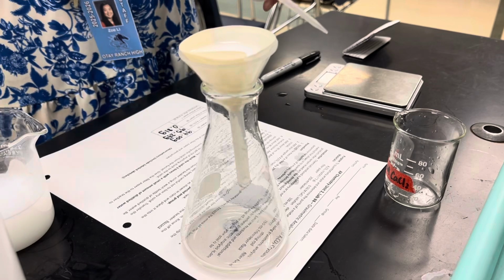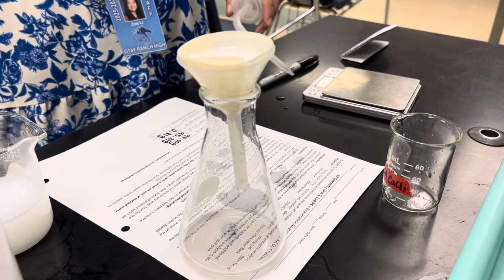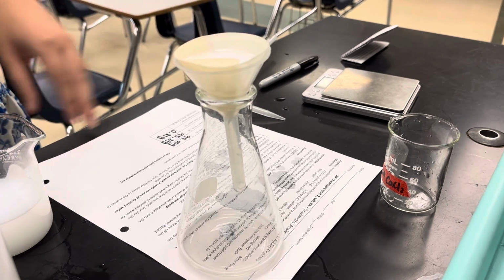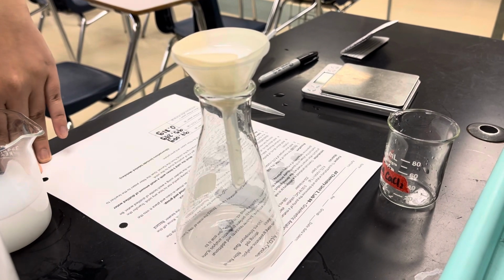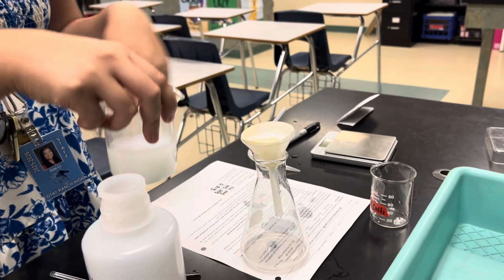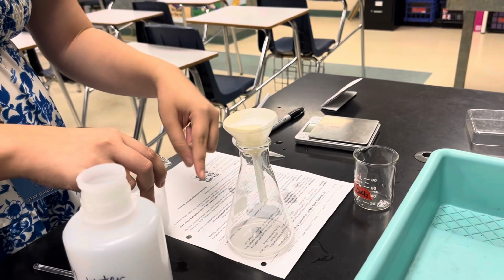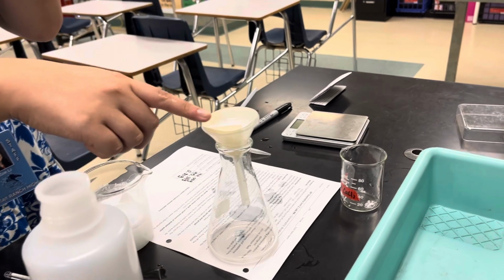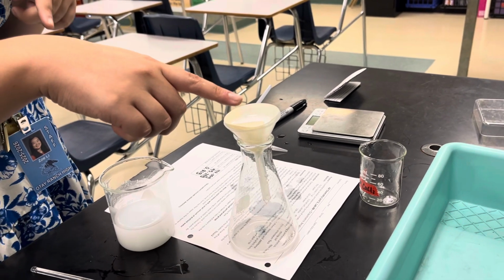So when we're done with this, I'm just gonna skip ahead and tell you the final mass so you don't have to wait here for 30 minutes and watch this video for 30 minutes. When we're fully done putting all of the solution into the funnel, what's gonna happen is the bottom is going to have a lot of colorless liquid. The top is going to be dry, but with only our chalk.